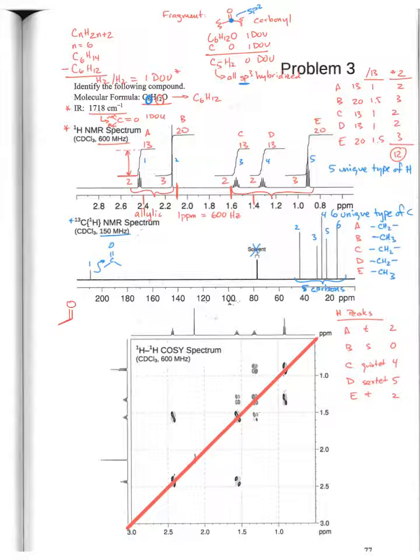We then move over, so we can say this is B. We have a CH2 group in the same chemical shift environment, so that's going to be carbon A. Carbon A, the protons appear as a triplet, so we know that that has to have 2 neighbors. And then we're looking at the rest of these that we have to assign. We need C, D, and E.